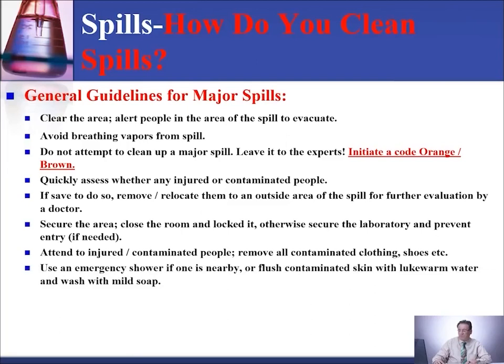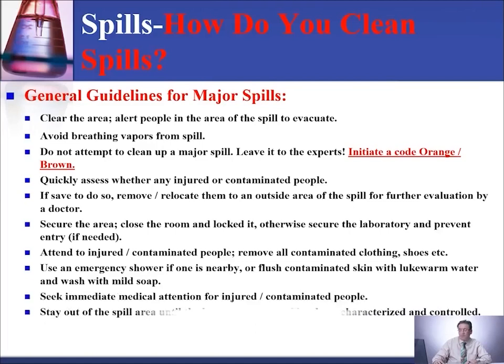Attend to injured or contaminated people, and remove contaminated clothing or shoes. Use an emergency shower if one is nearby, or flush contaminated skin with lukewarm water and wash with mild soap. Seek immediate medical attention for injured or contaminated people.